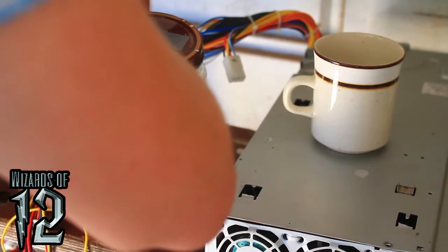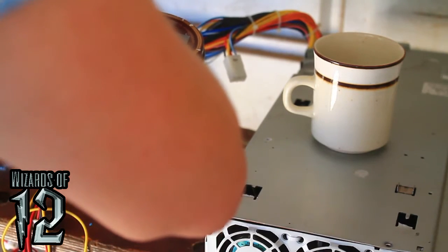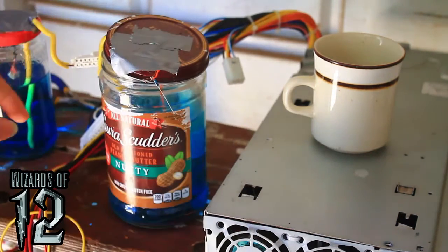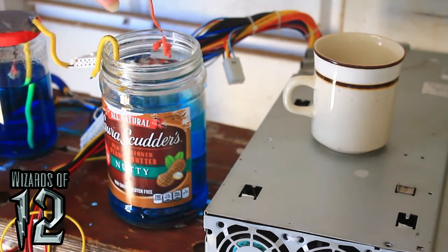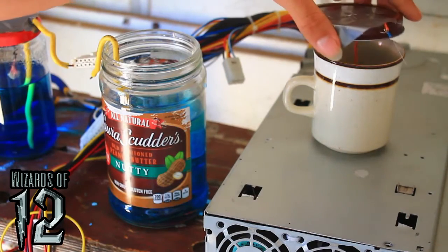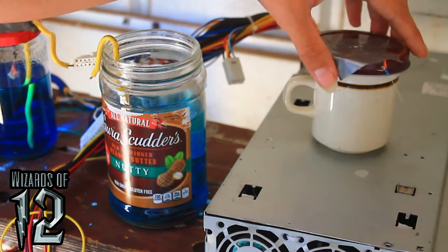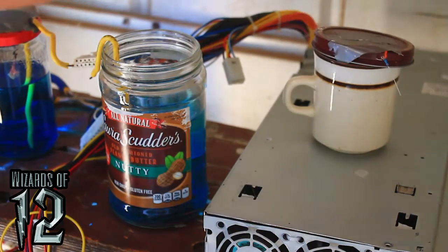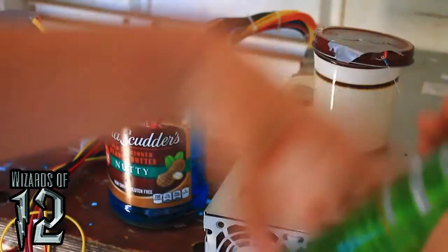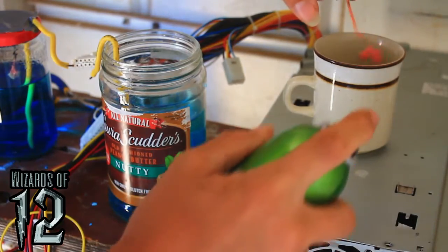Unplugging the negative lead now — wait, is this the positive or negative? Oh yeah. Oh, it's pink! I'm going to spray some hairspray on it as a fixative.